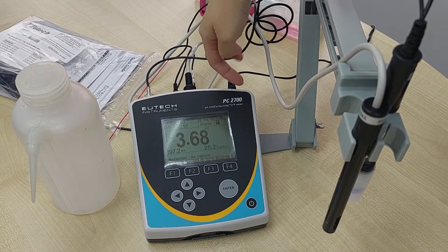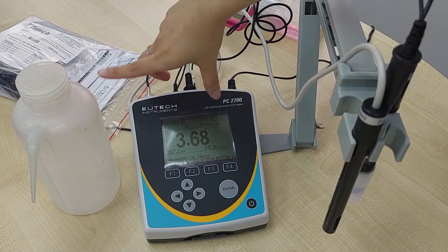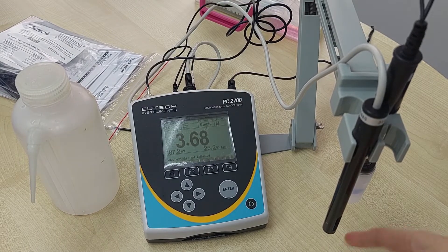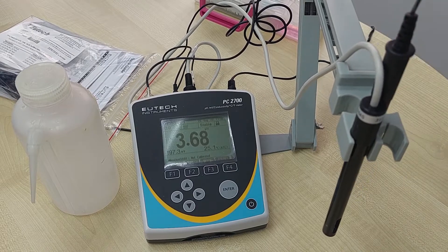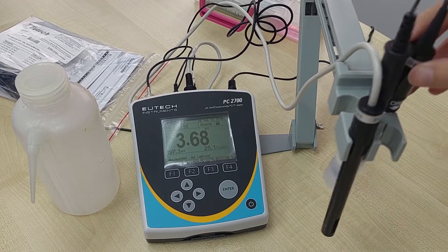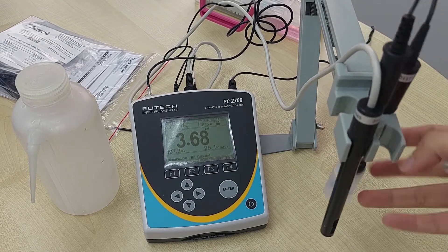This is the PC 2700 meter — the whole kit. It comes with a meter, a conductivity probe, a temperature probe, and a pH probe. It also comes with a holder like this for you to hold three probes together.